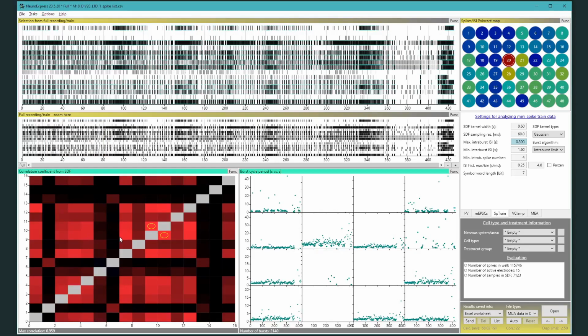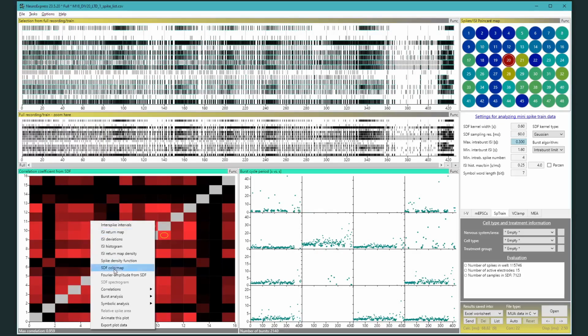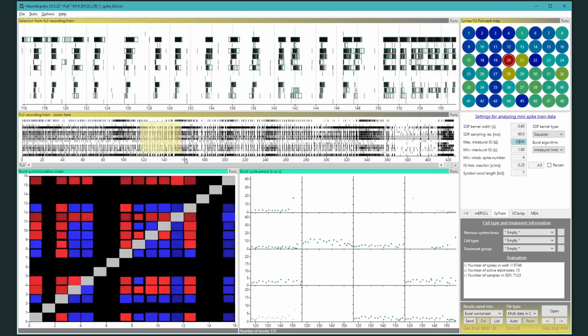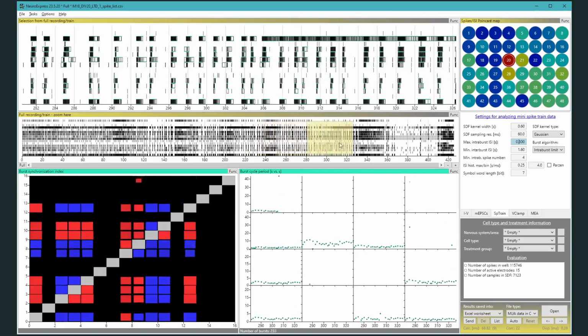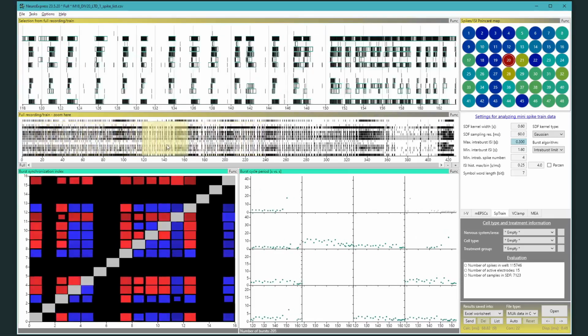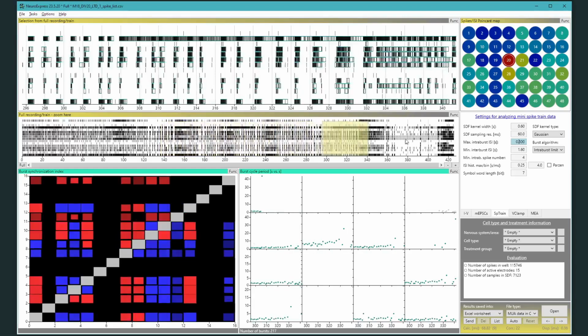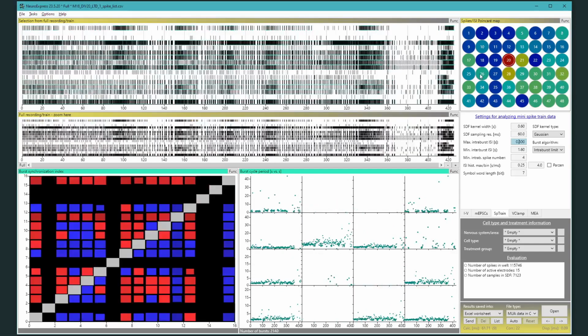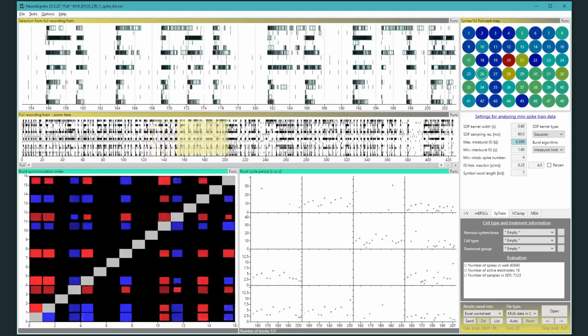Synchronization across neurons can also be analyzed by a matrix called the burst synchrony index. Here we can see the temporal relationship between the bursts of the compared neurons and how tightly they fire together. The colors indicate the order of the burst onsets, and the size of the squares indicates the temporal precision of the burst coupling. And you can also go across the entire recording and analyze how conserved these burst synchrony indices are. Okay, so just a few more nice examples of this burst synchronization for different wells.